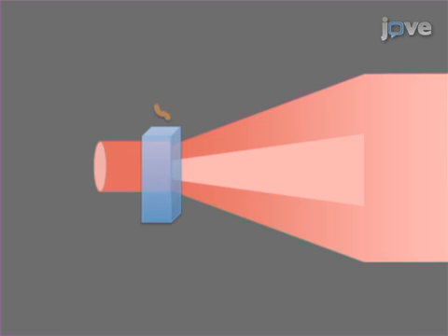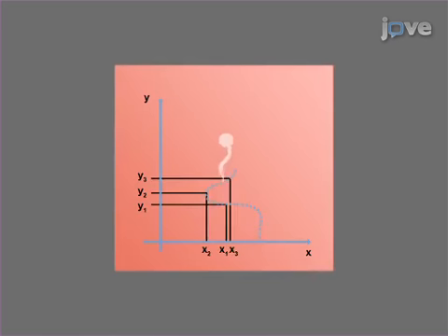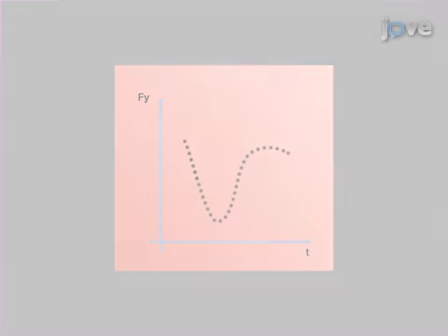Then an individual adult C. elegans is placed into the shadow experiment viewing chamber, which is a cuvette. The shadow of the worm as it descends through the laser beam is recorded as a movie, and the movie is used to analyze the motion of the animal. Hence, the path of a freely swimming nematode and the associated forces generated are determined.